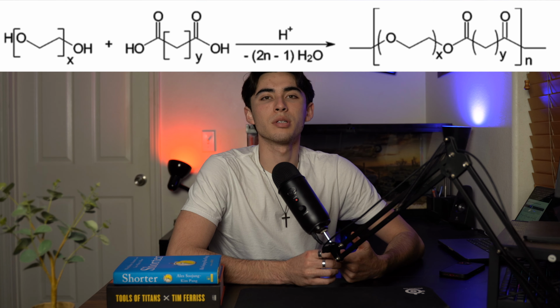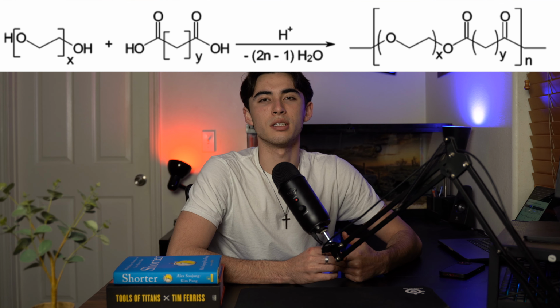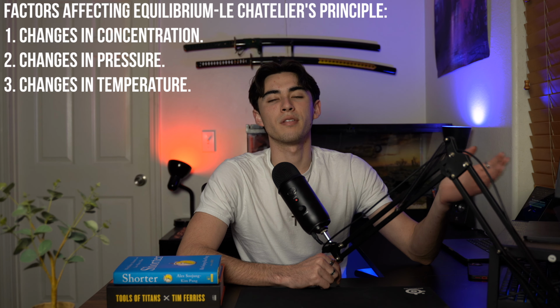To make the reaction proceed in the forward direction, we will be removing water from the reaction flask using a Dean-Stark trap. According to Le Chatelier's principle, removal of water causes the equilibria to shift, favoring the products. This can allow for higher conversion, especially in condensation reactions.